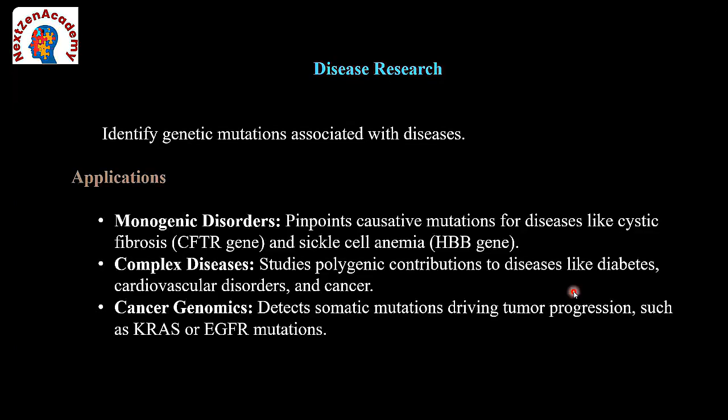Here is an example of different types of variants. This is the reference read. The reference reads have A, but when we look at the following sample reads at that particular position, instead of A, it has changed into C. But it is in the reverse strand, not in the forward strand. So it tells us this is non-variant.